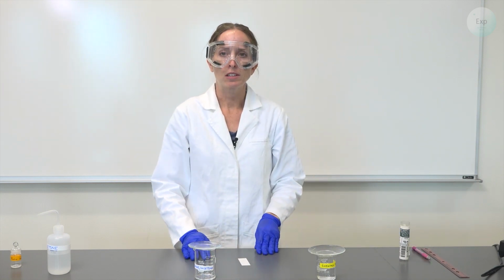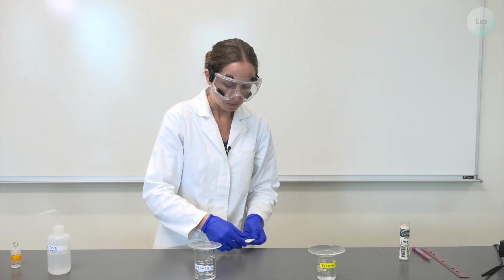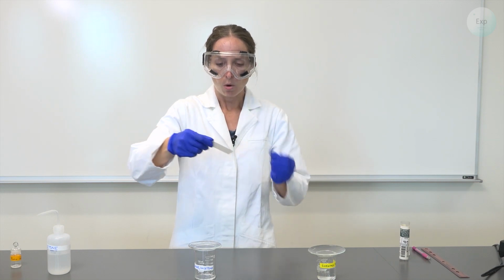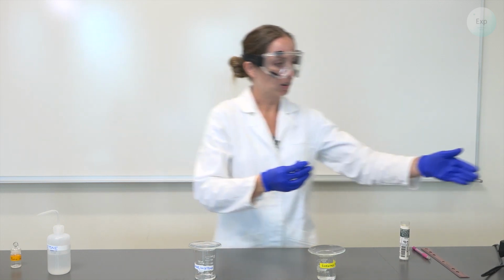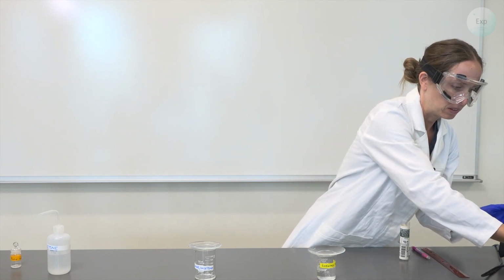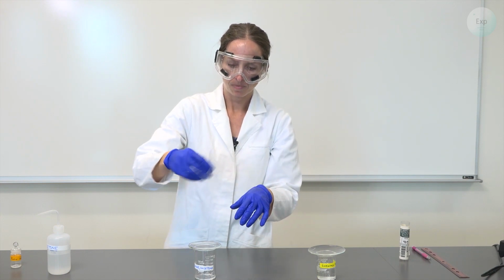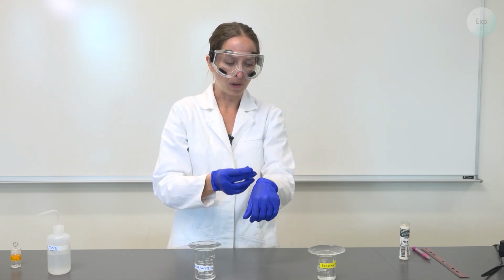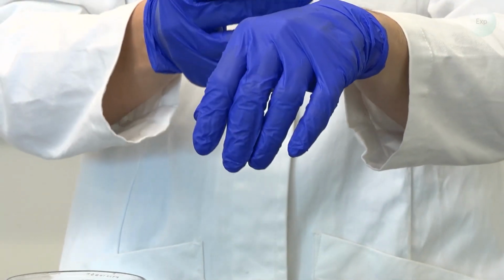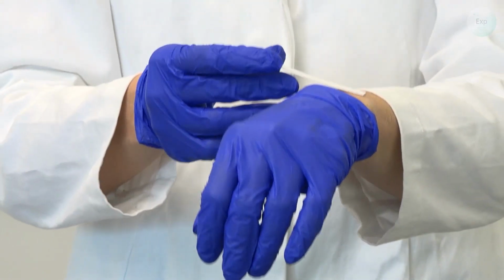Now, before running the TLC, it's necessary that all of the solvent has evaporated. You can do this by wafting it in the air or blowing on it. Or if your lab has air connection, you can turn that on and blow your TLC plate in that air stream. You can check if all the solvent has evaporated. If you hold it on the back of your arm, when it no longer feels cool, that means that the solvent which had been there has evaporated.